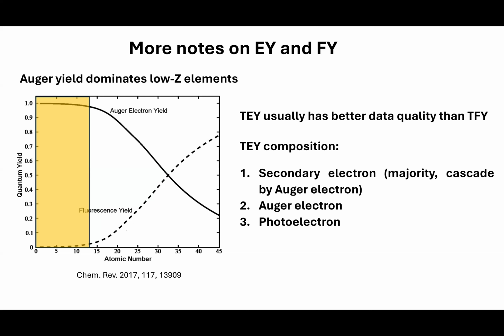So let's think about the process. When we have a lot of Auger electron decay happening, those Auger electrons will try to escape the solid. During this path of escape, they will interact with the neighboring solid materials. And that's a strong interaction. That gives rise to another decay process.